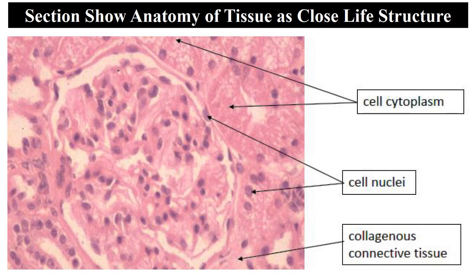Finally, this is the section. It shows the anatomy of tissue as close as possible to the living structure, including cell cytoplasm, cell nuclei, and collagenous connective tissue.